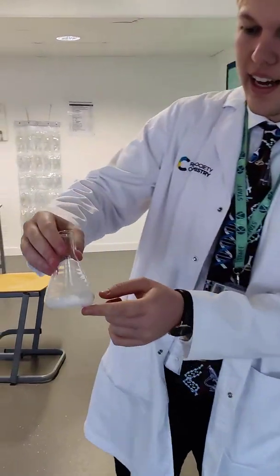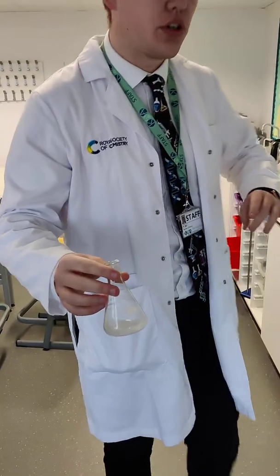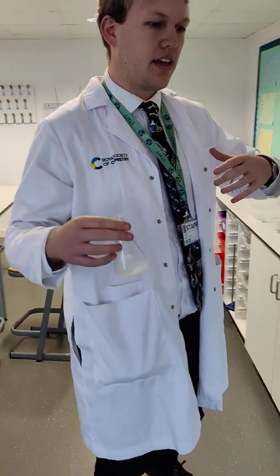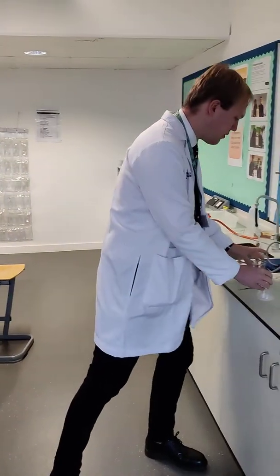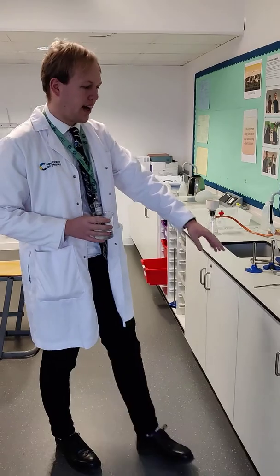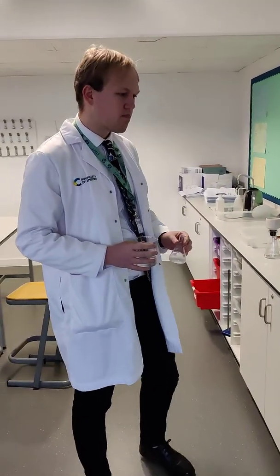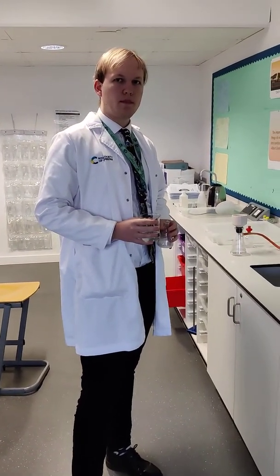You can see that it's a nice white product, but now we have to make sure that it's pure. At the moment it's got lots of impurities in it. The first thing that we need to do is add some water to our small conical flask. In the method, doesn't it say to add your reaction mixture to the water — why are you doing it the other way around?